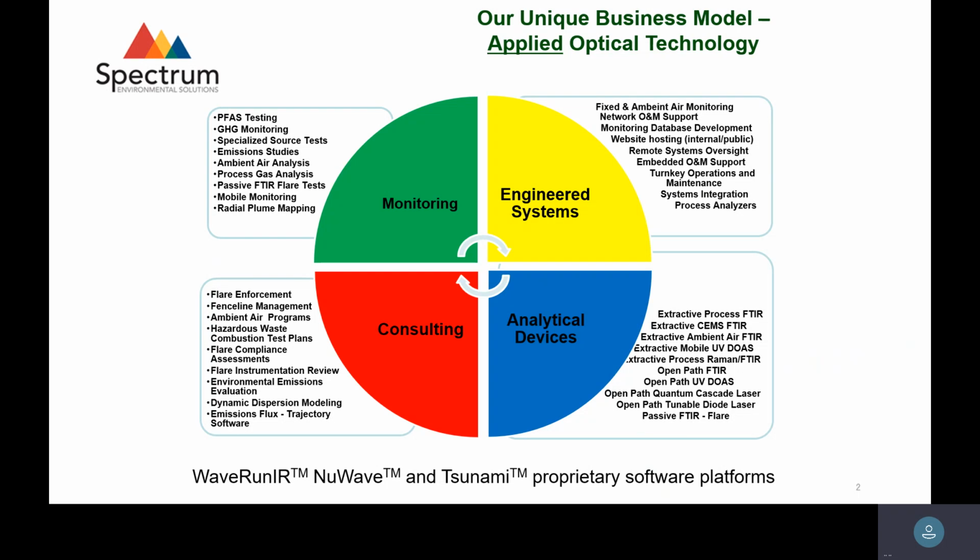instrumentation reviews. Many people don't know it, but I like to play in this unique world of dispersion modeling, not air mod, not permit modeling, but unique event modeling. Events from flares are uniquely interesting to me, but also other types of trajectory, backward trajectory modeling, and some other interesting things. Our monitoring group uses our equipment and everybody else's equipment to do a whole variety of studies, mostly in the FTIR UV world, but also using other devices, usually weird, strange, and unusual things.